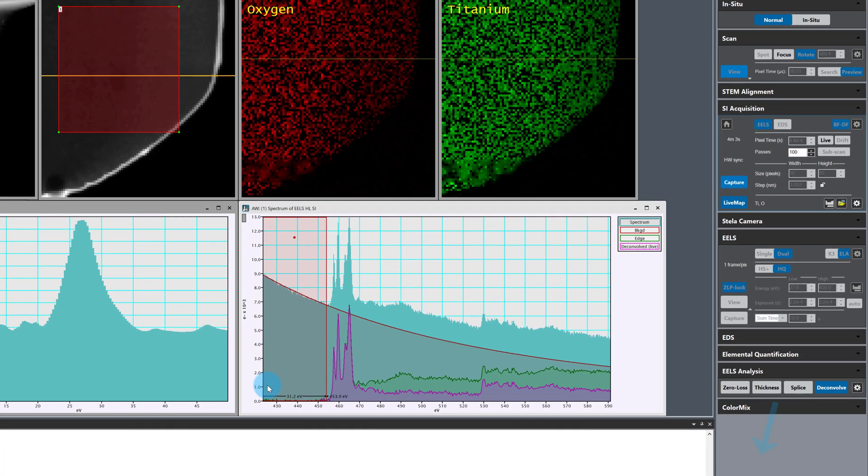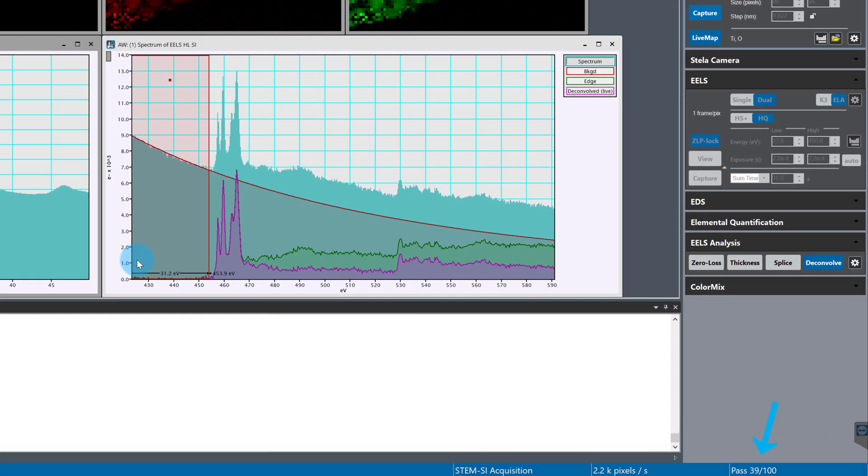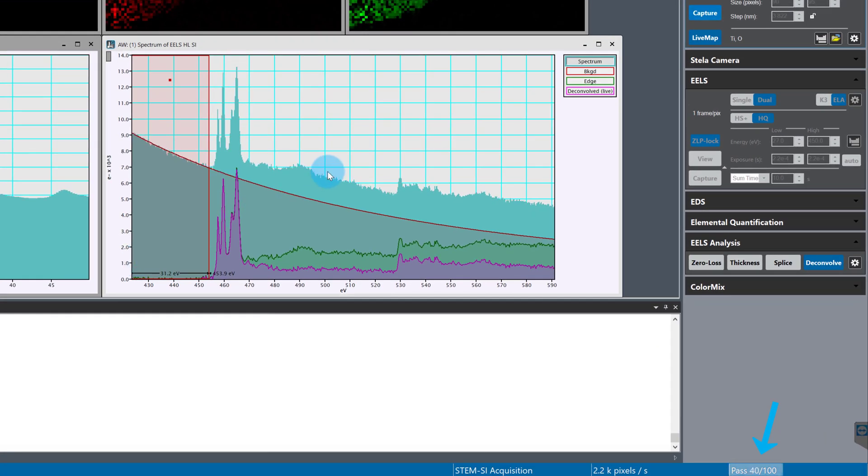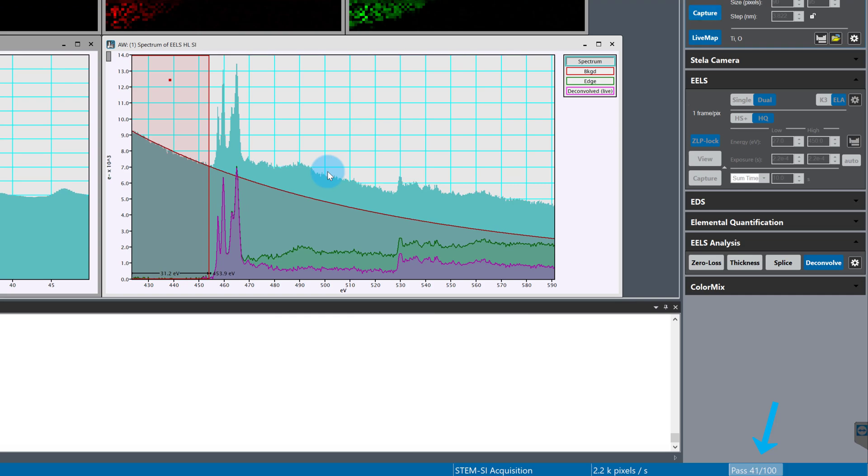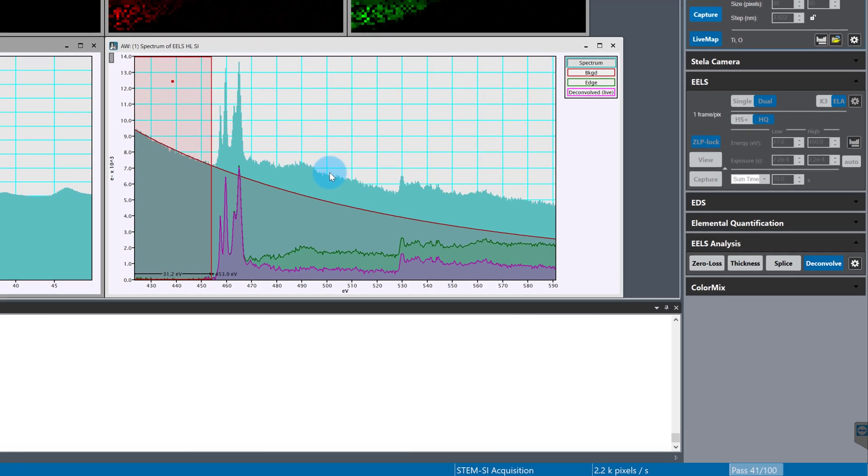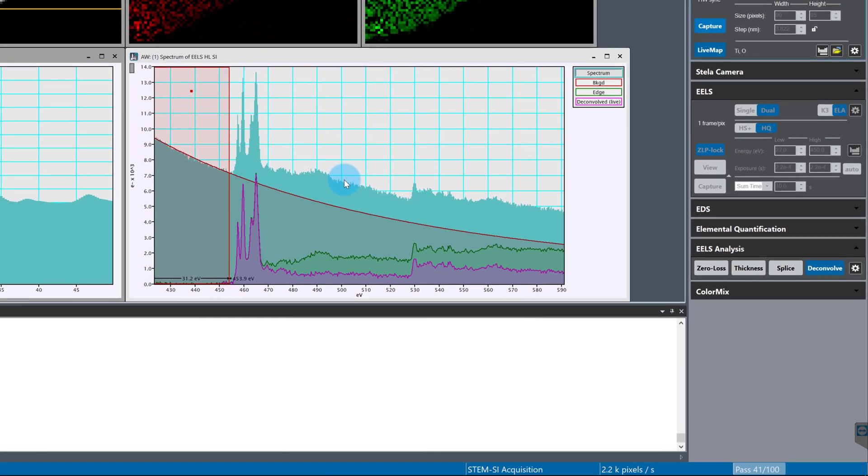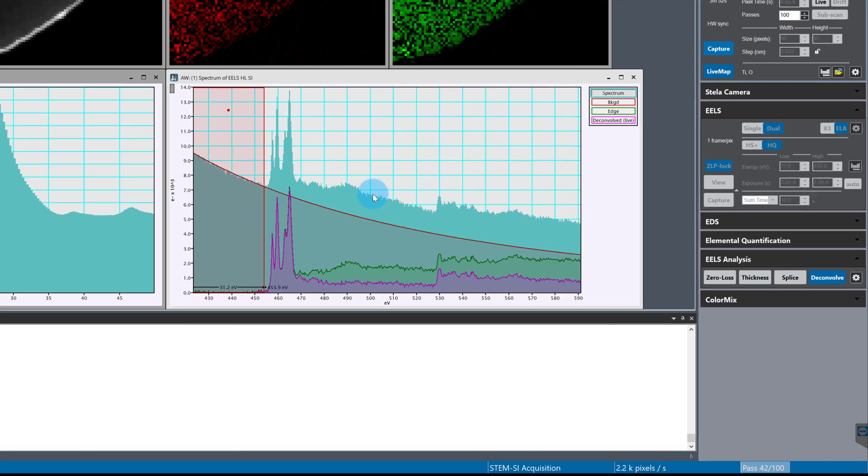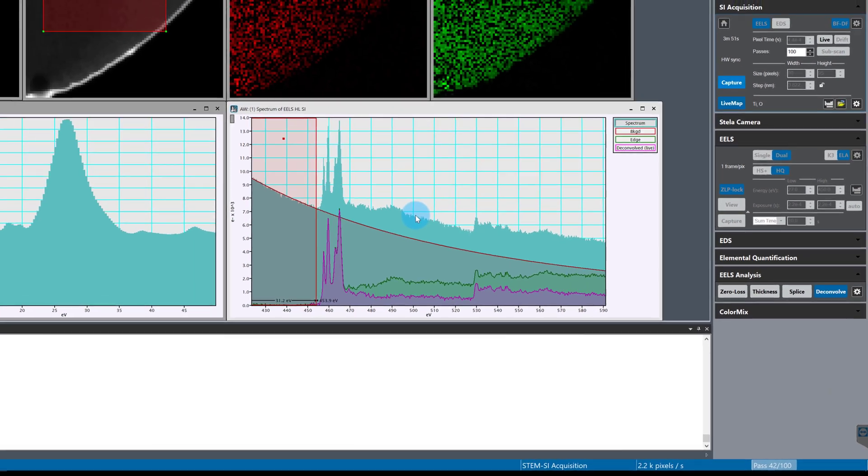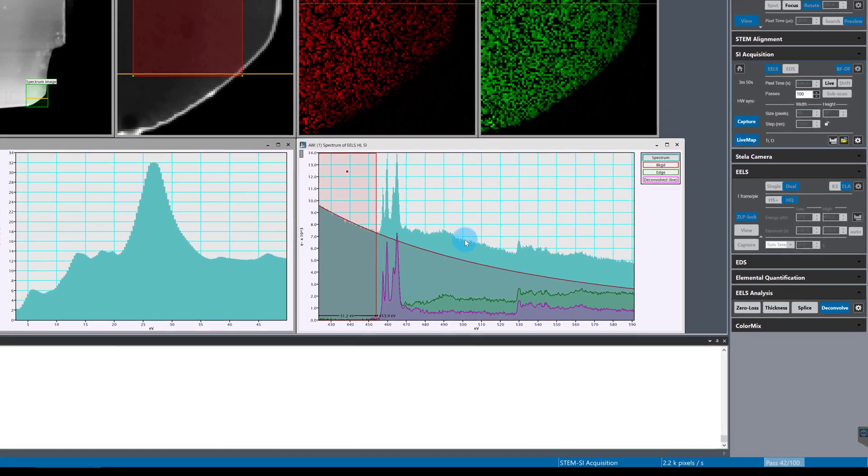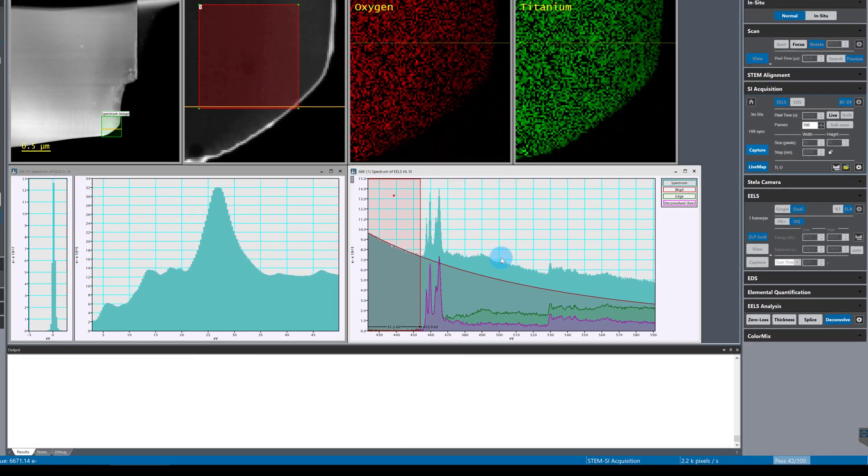I'm pretty happy with the signal to noise ratio and how it's improving in the oxygen K edge. It looks like I'll be about where I want to be with 100 passes so I'll let the capture run to completion and not finish early or add any more passes.